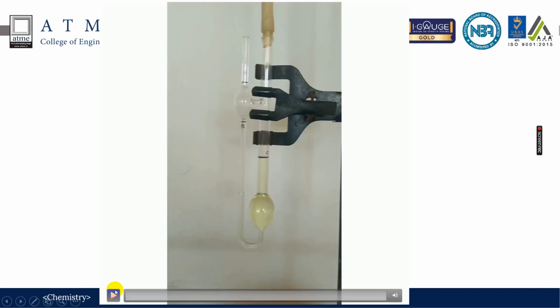So this is an experimental demonstration. This is our Ostwald viscometer where we have highlighted it to make it more visible. We have filled the known volume of a liquid, organic liquid, up to this mark. And there is a mark between A and B. We call this upper mark A and lower mark B of an Ostwald viscometer, which is connected here. So typically the liquid, it may be a lubricant or any other oil, is blown from here, allowed to suck from here.